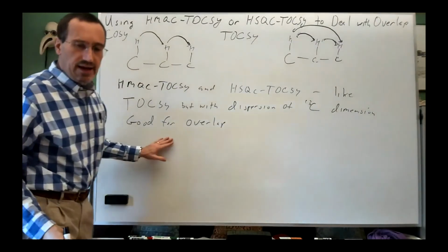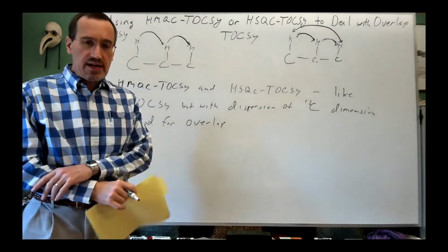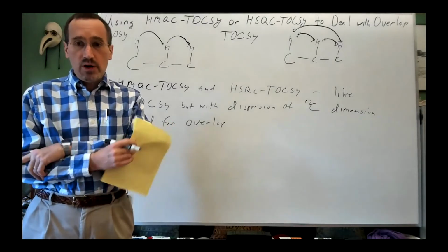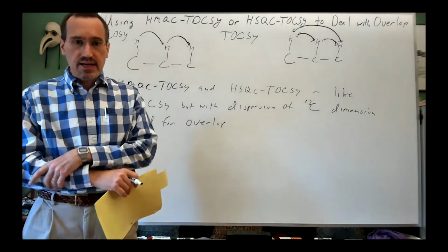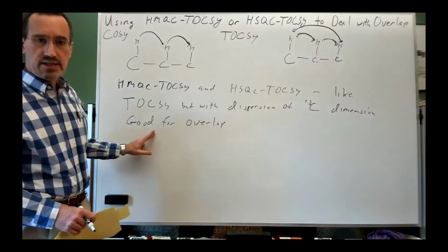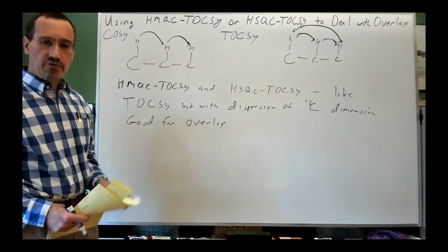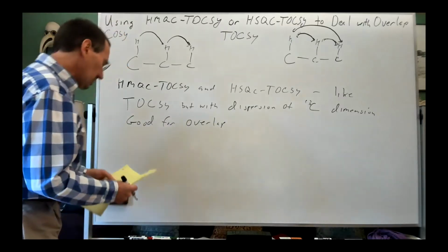And you're going to have two examples. We implemented this in the course in 2011. I had started teaching about it, I think, in 2004, and it really was a wonderful TA, like James, somebody who really brings tremendous ideas to the course, who finally got this up and running on the spectrometers. And so we're going to have two problems this week where you get to take advantage of this, and that will be the fourth and fifth homework problem, where there's some moderate to severe overlap, and it's going to really help you pick out the spin systems. So it's good for overlap.